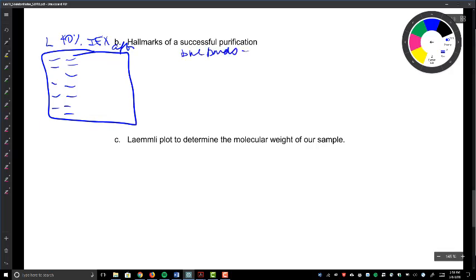And again, these are blue bands because Coomassie is blue. But as we progress throughout the purification, in theory, the number of bands should decrease. So let's say this is LDH right here. Ideally, by the last step, there won't be any other proteins, and the intensity of the LDH band will increase, or be enriched, because our LDH solution is becoming more concentrated. So in theory, as you progress throughout the purification, the amount of other proteins is going to decrease.